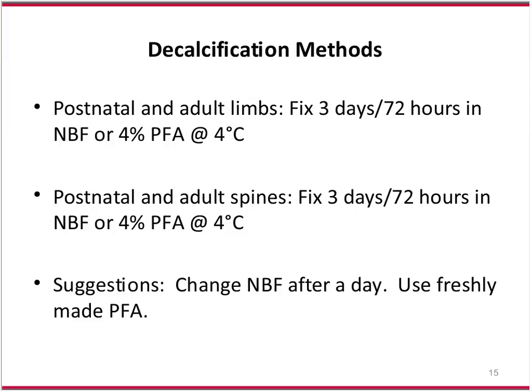Postnatal and adult spines are fixed for 3 days or 72 hours in 10% NBF or 4% paraformaldehyde at 4 degrees or, like I said, room temperature. It's really up to you. As I said, I really suggest that you change your NBF daily and definitely use fresh paraformaldehyde.